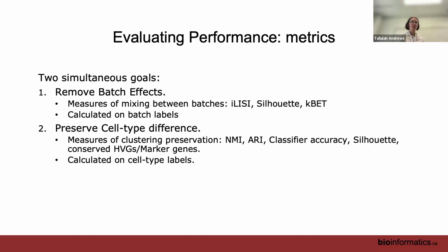We can also evaluate the performance of these methods. Yeah, so someone in Ottawa has used Azimuth. They say it's not great for monocytes. So yeah, it can work, but it doesn't always work. So you also have to be careful.